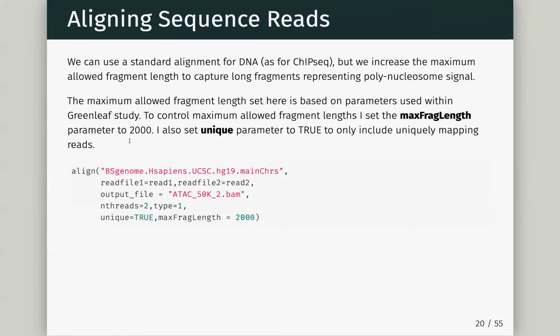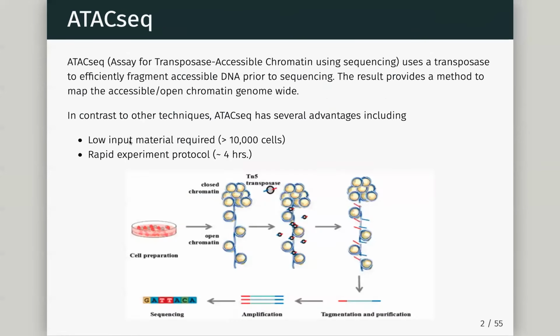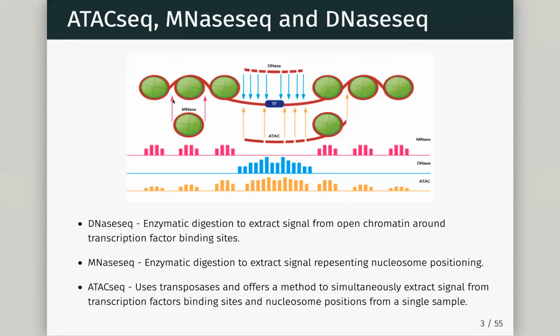So you're saying, so whereabouts would that be here? So like here, from here to here. Yeah, if that was all open, hopefully though, we would have had a chop here, and then this region for sure we would have got some chops in, right? Transposase would have got in. So I guess that's the idea.